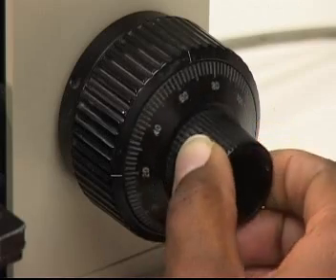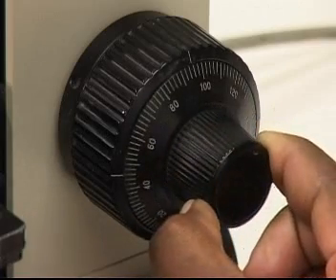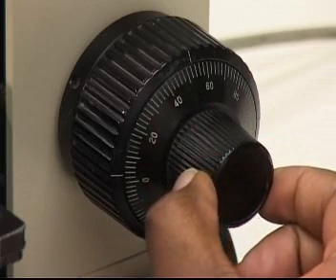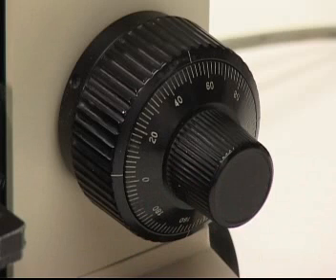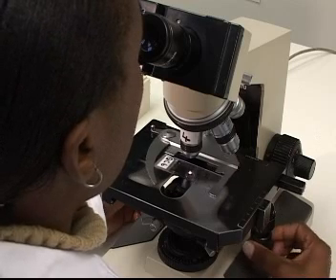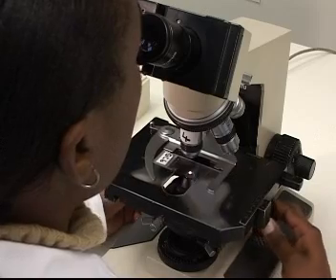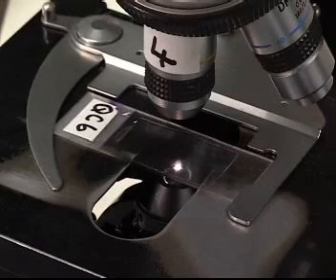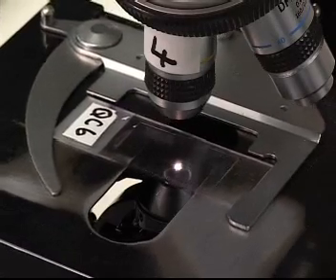If the image viewed is blurred, you can use the fine adjustment to focus the image until it becomes clear. This is the fine adjustment screw here. It is used to make small movements to the stage and helps focus the slide. The image is focused at the point where we have the clearest or sharpest image. If you find that the image is out of the field of vision, keep looking through the eyepiece and then move the slide very gently until the image is in the center of the field of vision.